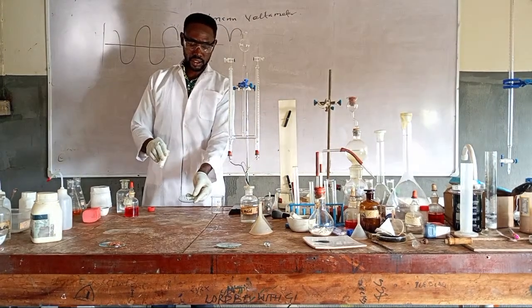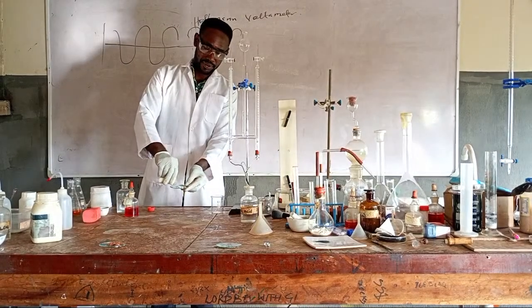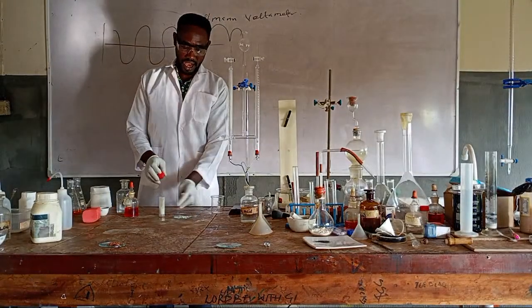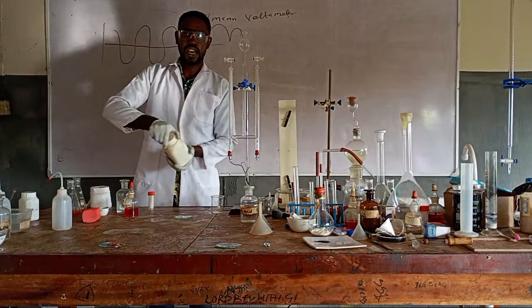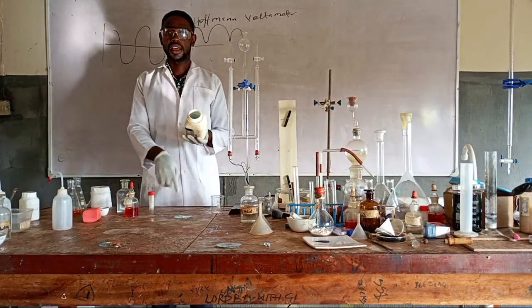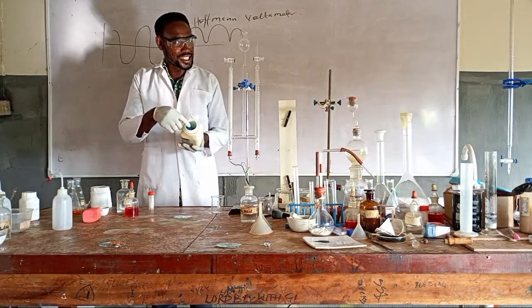At least I hope you can see it. It's somehow an off-white color. This is the anhydrous, while over here is the hydrated. So what's the color? How did I change this to this? By heating it. How did I change this to this?